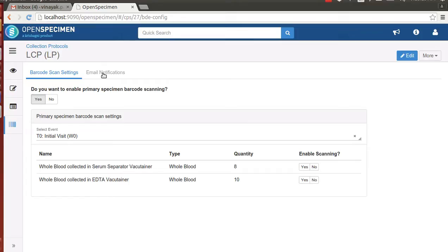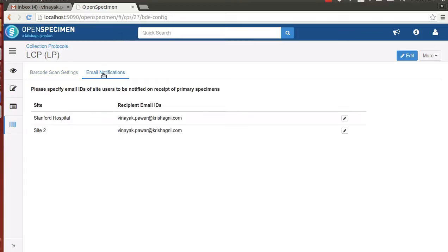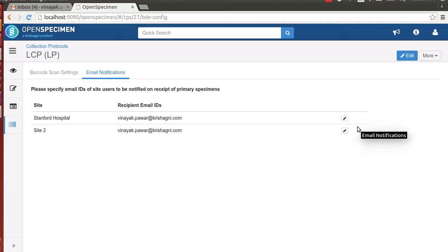Once the primary specimens are collected, a notification is sent. This is the place where you configure the email IDs of the persons who are supposed to receive the notifications once the primary specimens are collected.